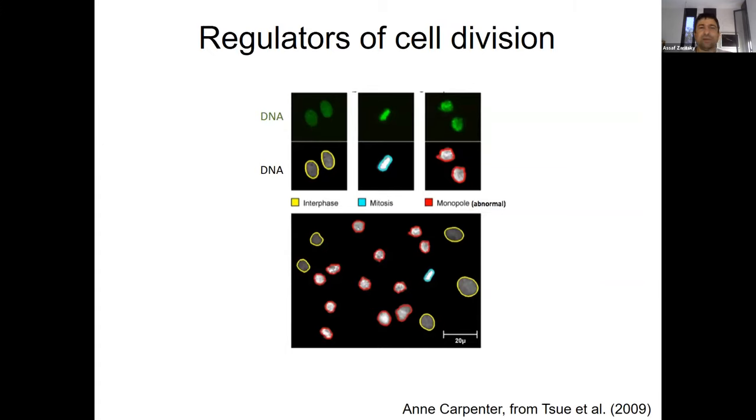So here is an example. You let a human annotate. So here are different annotations of the cells in the context of cell division. And now you let the machine train, extract all the morphological features, and use whatever it needs to predict the phenotype accurately.